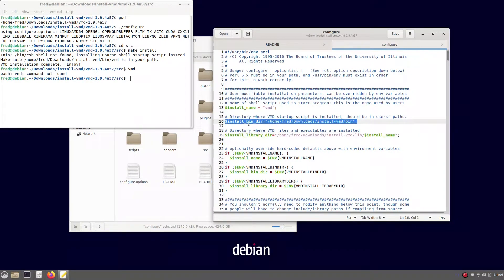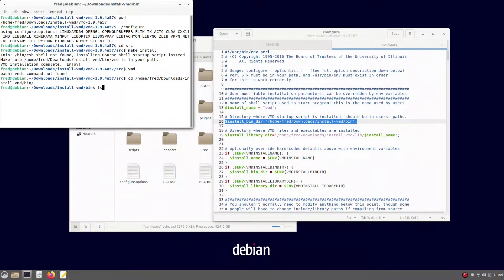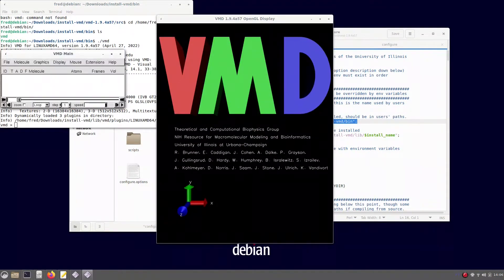So after all that, VMD is correctly installed. But you can only run VMD from that place, or by giving the entire path to the VMD script — by typing, for example, dot slash VMD in that directory. You can open VMD just as fine.